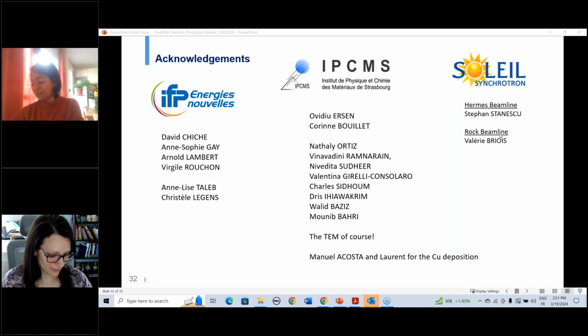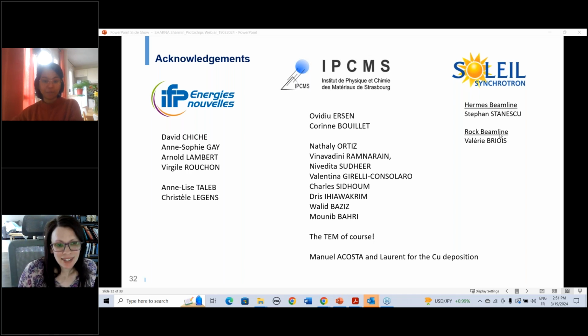But in other cases, definitely, when we carry out catalysis, for example Fischer-Tropsch or other catalytic reactions, we are concerned about the product. As a result, we would like to know what product we are getting, and we can eventually correlate it with the catalytic activity. People have done it already, and in our group we have done it already.